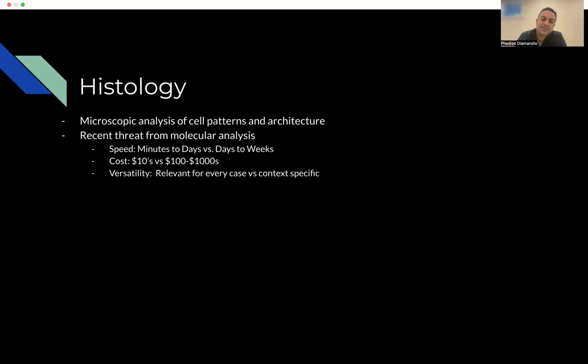So you must know what exactly you're looking for before you use those molecular tests. So the versatility of the H&E stain is quite remarkable, and is probably the most dynamic stain, in my opinion, in all of pathology. And again, these are complementary, right? Certain things you can pick up with genetic mutations, but other things like hypoxia, inflammation, may not appear on genetic sequencing. So these are in fact complementary.